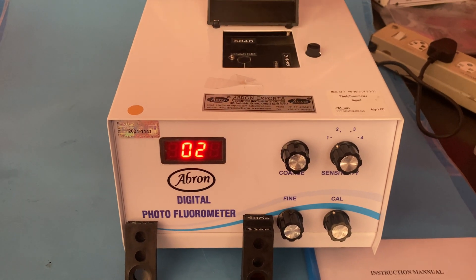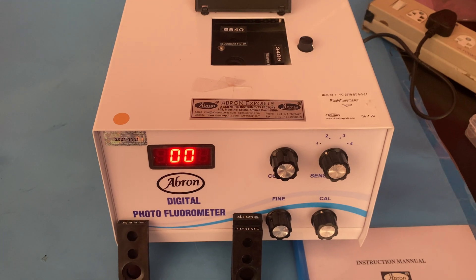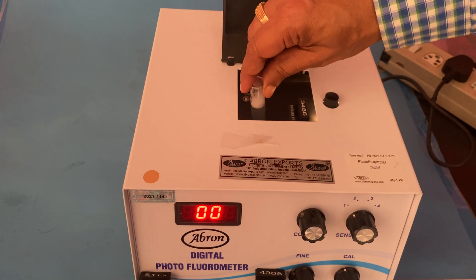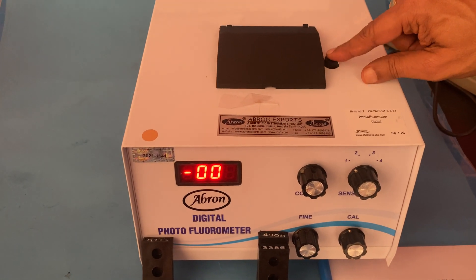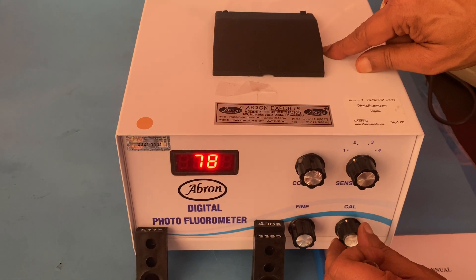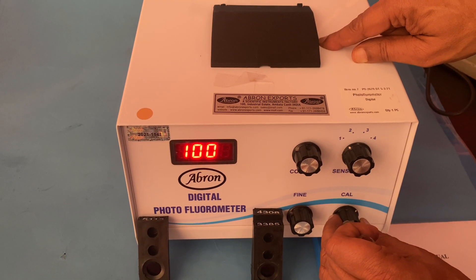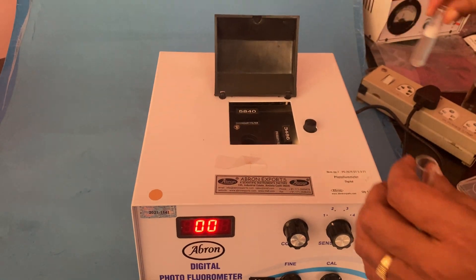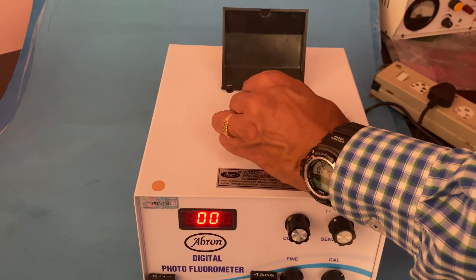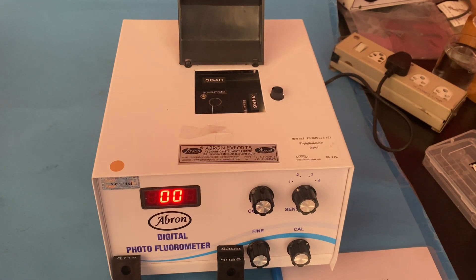Now I put in a standard solution — I have taken a random chemical, not a proper standard solution at present. I press it and put it on the hundred scale. It should come up as one hundred. Now I can go back and put any sample which is to be tested.